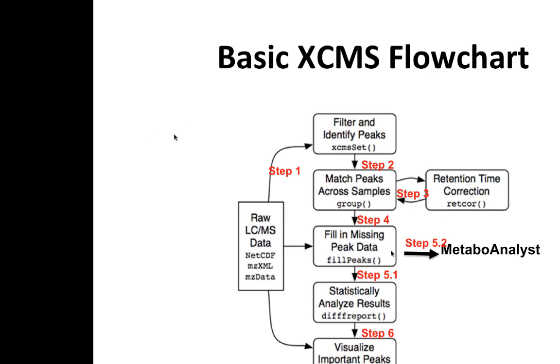After we fill the peaks and align them, we can export to MetaboAnalyst to do statistical analysis. But we're going to stop here because that is the next module. So all we need to do is these first three steps. XCMS also has a built-in t-test, a diff report, and we can briefly see what this simple t-test can do. From here, we can visualize the peaks, because in visualization we really want to see whether they are artifacts or real peaks. So this is also important.